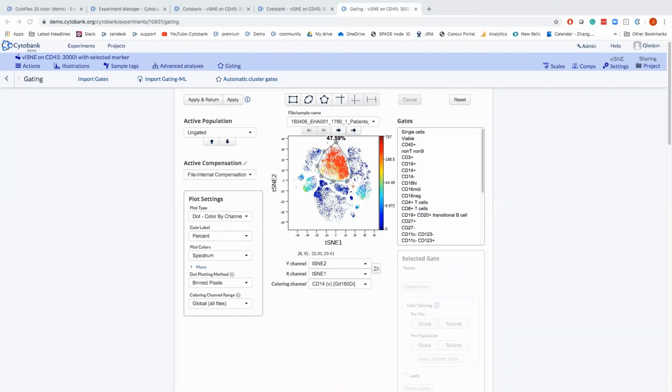Okay. The next question: how trustworthy are low expression values of CyTOF data in terms of CD19 dim cells demonstrated in the viSNE? Is that true staining or more likely background? I'll take a crack at this one.